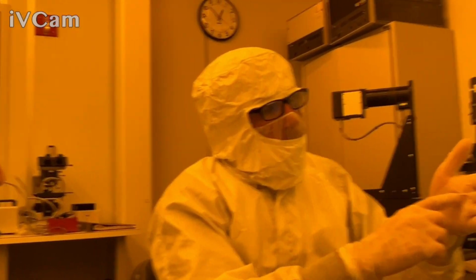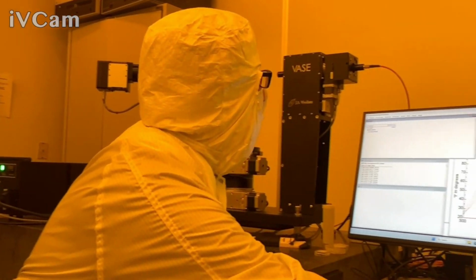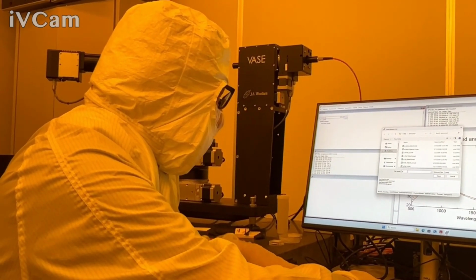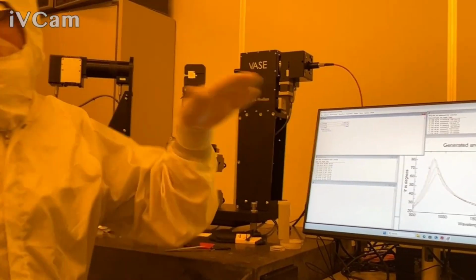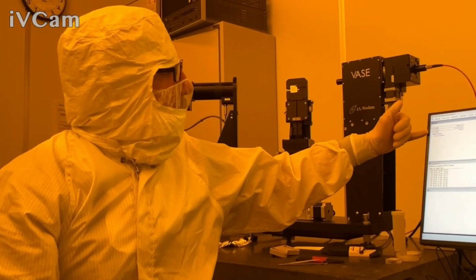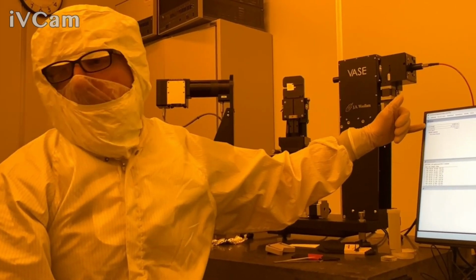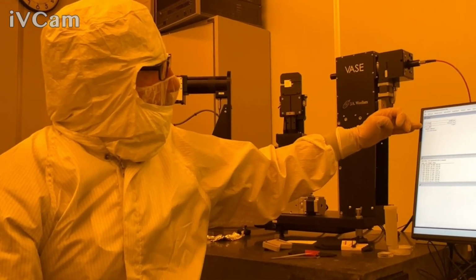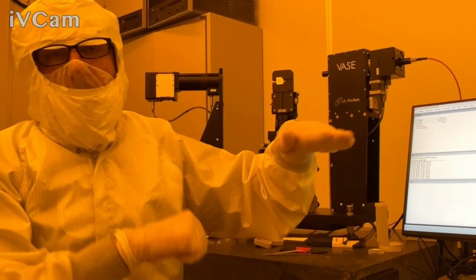So whatever the light interacts with, if there's roughness on the film, by default you would add a layer called S-rough, or surface roughness. It's going to treat it as a surface layer of lower optical index. Whatever my top layer is in my model, it's going to mix this with 50% of the optical properties of that layer and 50% of air, or void, n equals 1. Now here you can be a little bit less sensitive to surface roughness because my index is so low. There's not a lot of optical contrast between 1.4 and 1.